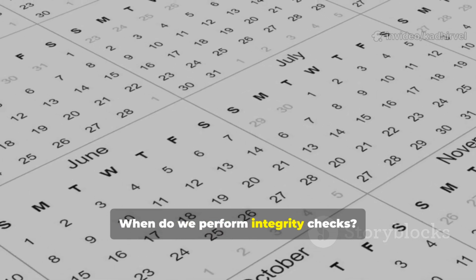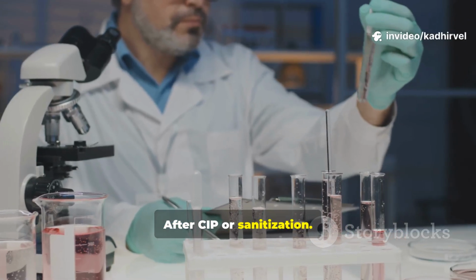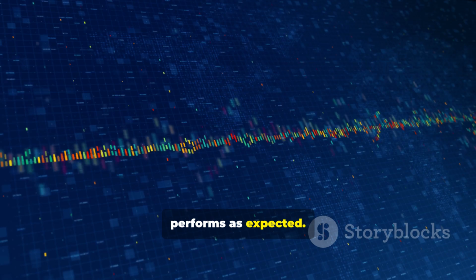When do we perform integrity checks? After packing. Before every production campaign. After CIP or sanitization. When pressure flow behavior changes. If channeling or cracks are suspected. This ensures the column consistently performs as expected.